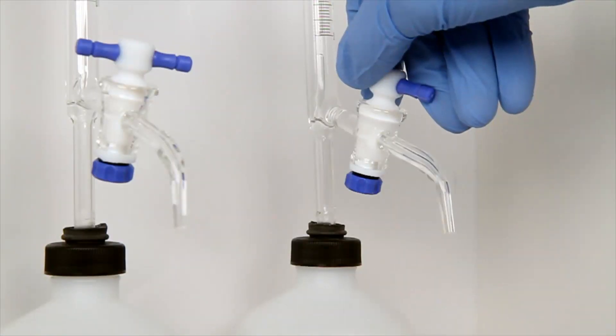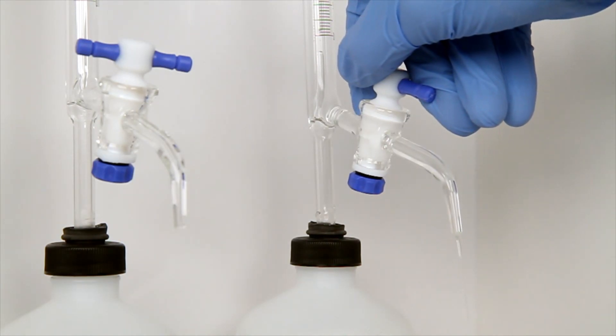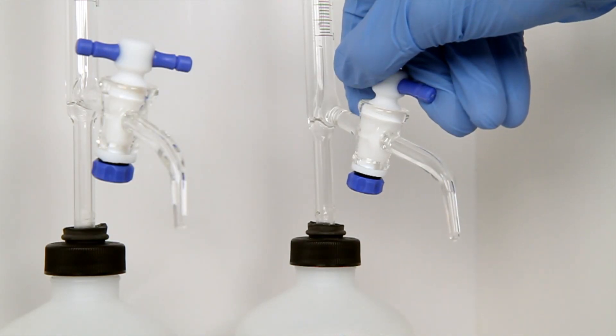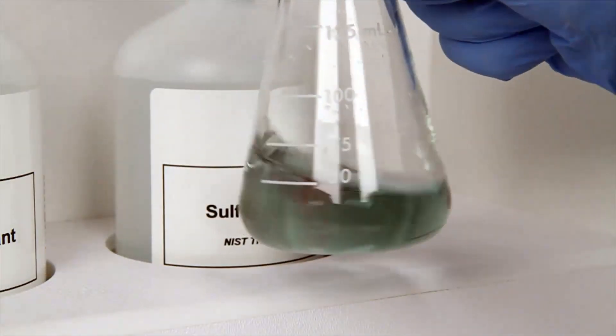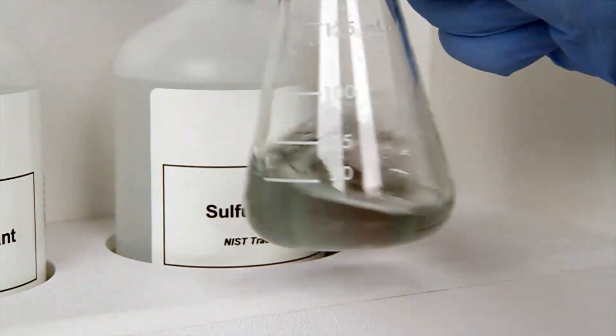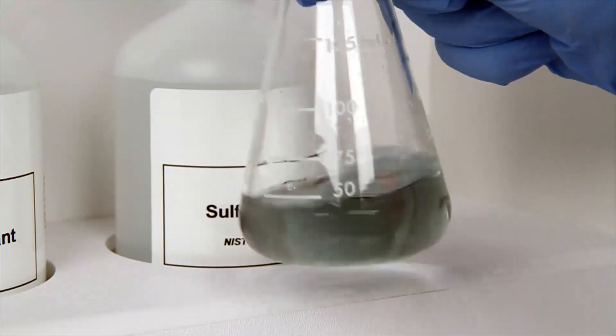The next step is to titrate the sample with sulfuric acid titrant using the burette. Turn the stopcock to add the titrant to your sample. Make sure you are mixing the sample while you add the titrant. As you near the endpoint, turn the stopcock so the titrant is being dispensed slowly. Make sure you are mixing the sample after each drop until the sample color changes from green to red.